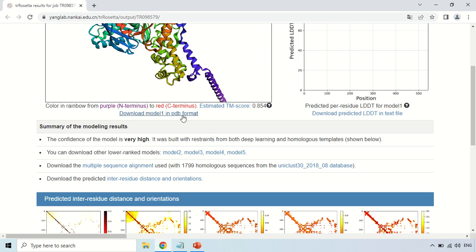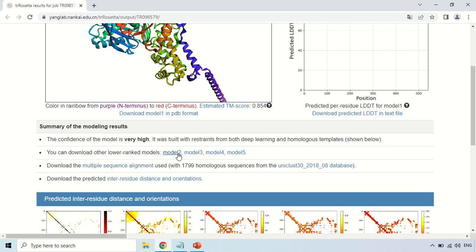You can download this structure by clicking 'Download Model 1.' Similarly, the software has generated more than one model — Model 2, Model 3, Model 4, and Model 5. Just click here and the next model will be loaded. You can use any of these models for your research purpose.